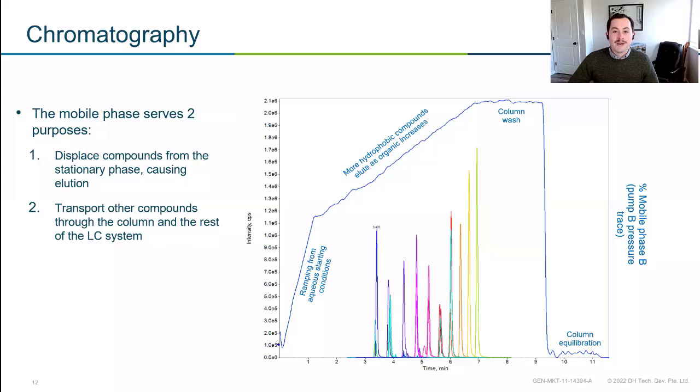Next would be our ramping phase. So this sort of gradual ramp where our compounds are actually eluting. So we're ramping from aqueous to organic. Our compounds are beginning to elute. And then once our last compound has made its way off the column, we'll hold it at a very high organic. And this is a really crucial step. So typically we want to hold it anywhere from 95% B all the way up to 100% B. And the reason we're doing this is to essentially wash off the column.